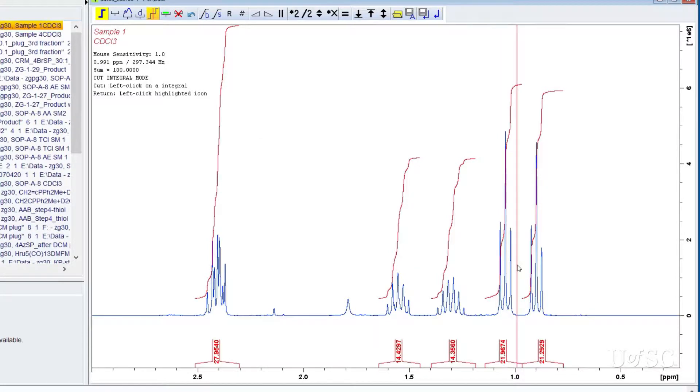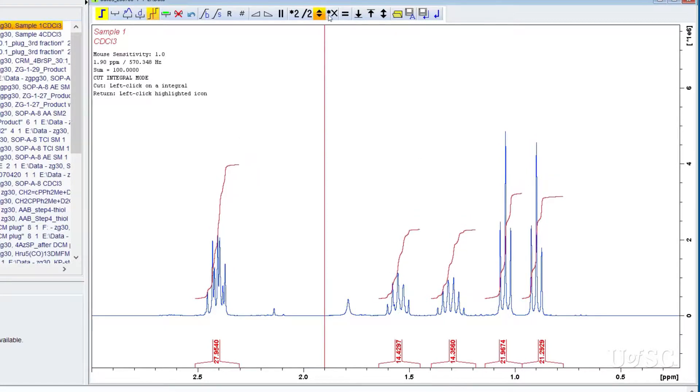The integral values should now add up to 100. The other buttons on the row are mostly for changing the size and position of the integral curves. However, they have limited use since their changes do not carry over to plotting or the data window when you exit the integration tab.